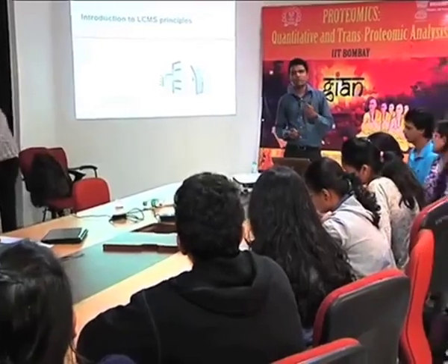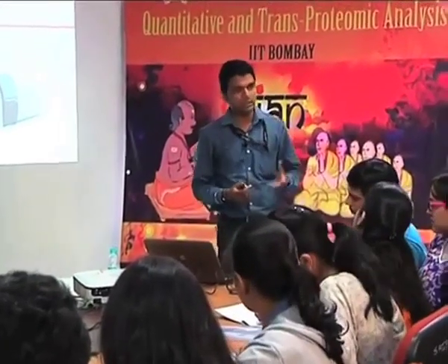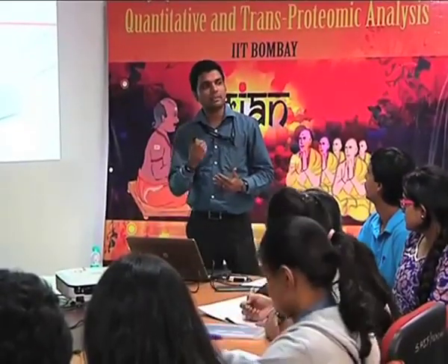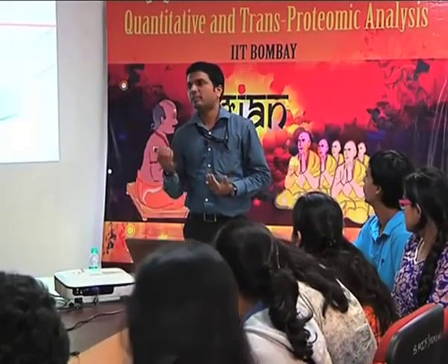Today I am going to discuss the basic principle of the LCMS and the LCMS system. First of all, we will try to understand what the triple quadrupole is, what LCMS is, what the basic function of the LCMS is, and how it works exactly. After this, we can see how we can inject the sample, how we can get the data, and how this type of instrument is helpful for the targeted proteomics experiment.